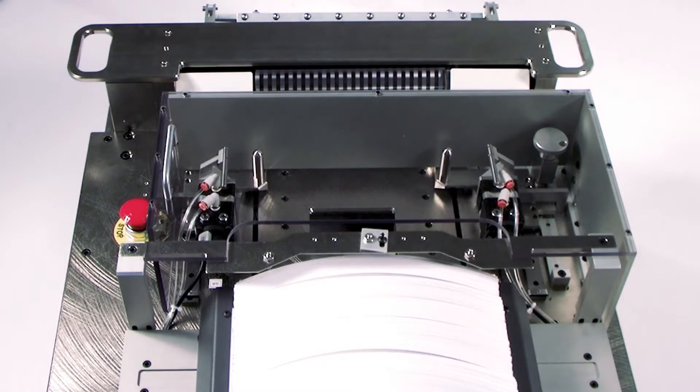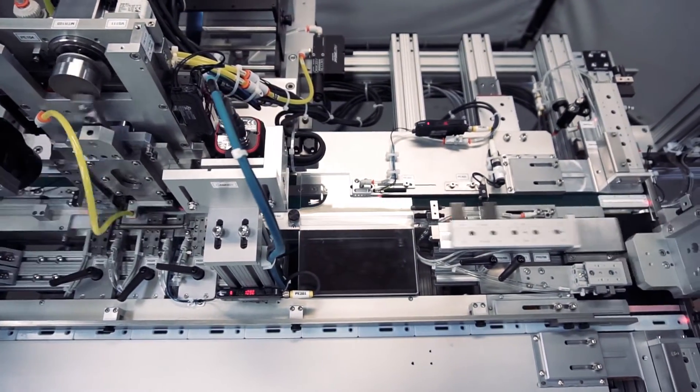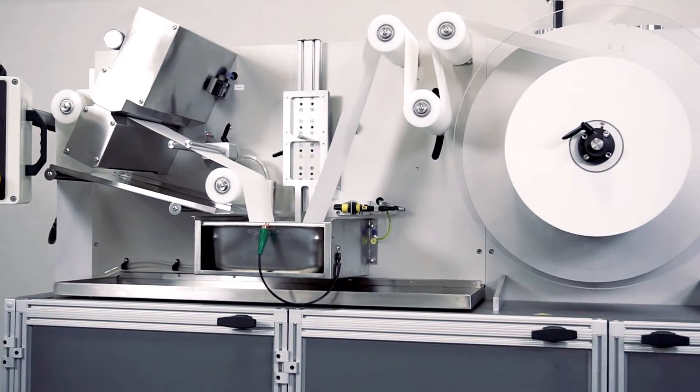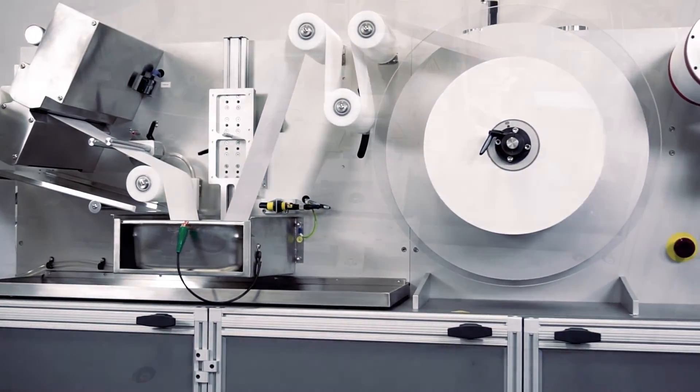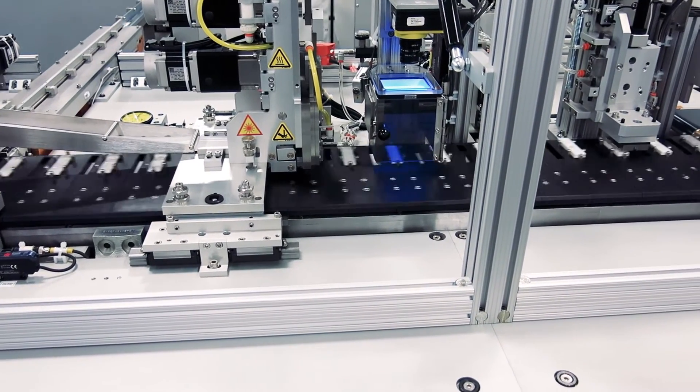The matrix line offers lateral flow assay developers and manufacturers a variety of solutions ranging from benchtop modules to semi and fully automated systems for laminating, dispensing, dip coating, rotary slitting, shear cutting, and cassette assembly.